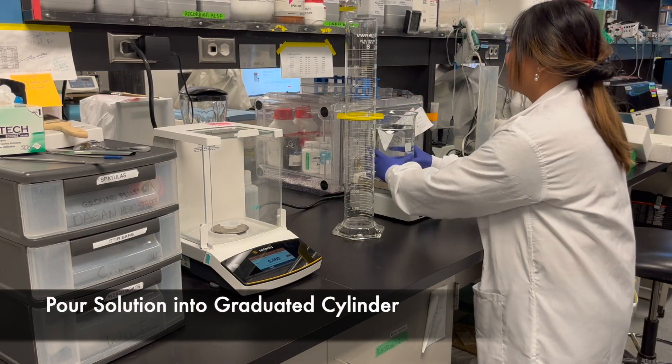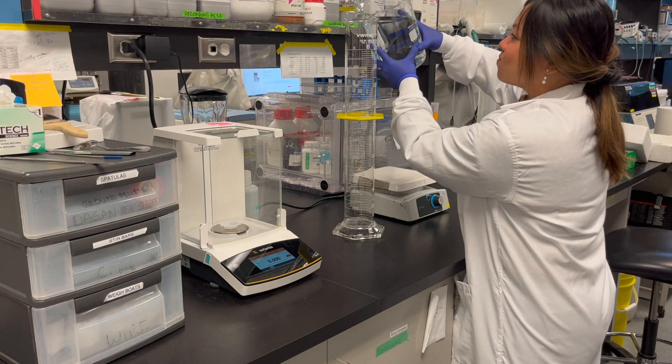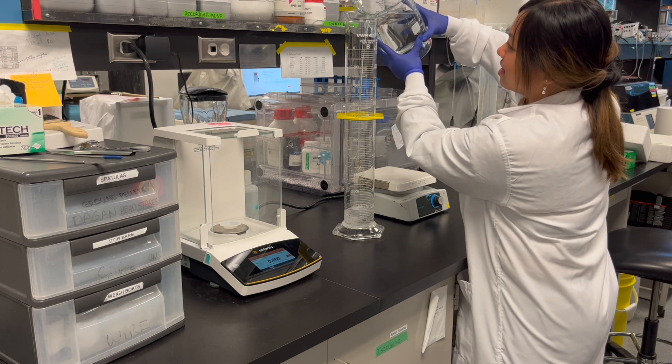After all ingredients are added, the solution is transferred to a graduated cylinder and topped up with deionized water to reach the desired volume. In this case we are making two liters.